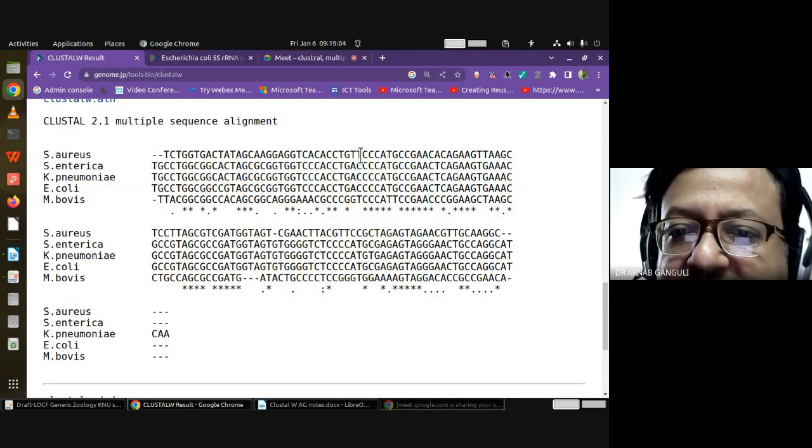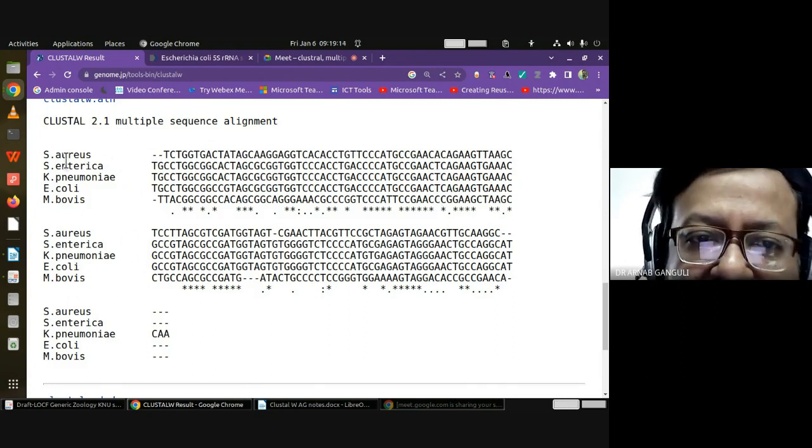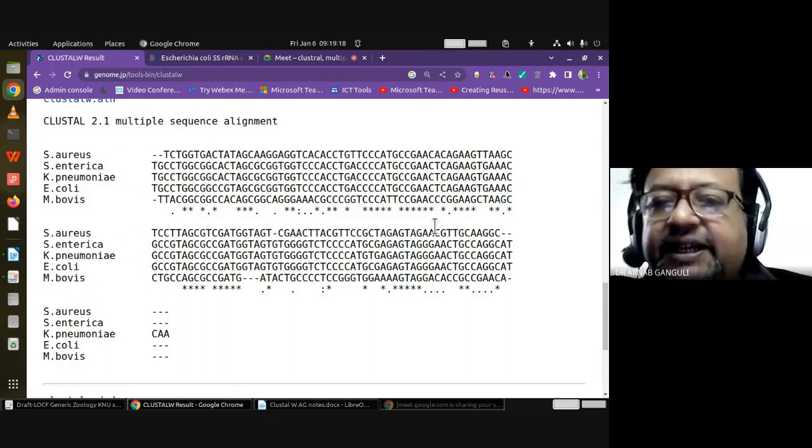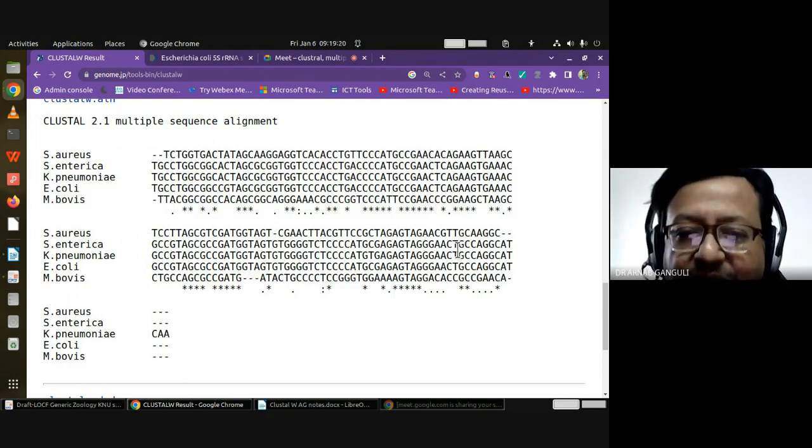Here, see, these are 100% matches. Where the star sign is, that whole line is a 100% match. The others are not 100%; either one or two or three differences exist in one organism or the other. Is this clear? Did you understand? Say yes or no.